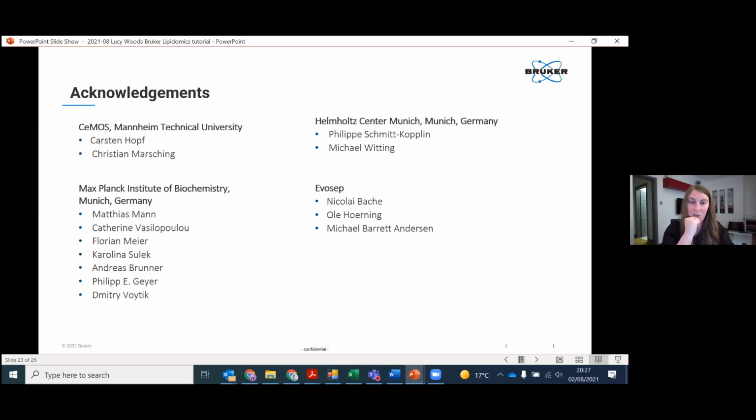We don't have FDR in our software, but we get increasingly asked that question. And there's a lot of different discussion on what approach to be taken. I'd really like to see within the next 1 to 2 years it starting to be implemented into different software packages. So I think with the Lipid Maps Consortium, and I know there's a lot of work with metabolomics standardization, hopefully that's an area that we can work towards and agree on a way to actually calculate FDR, but there's certainly a lot of discussion around it.